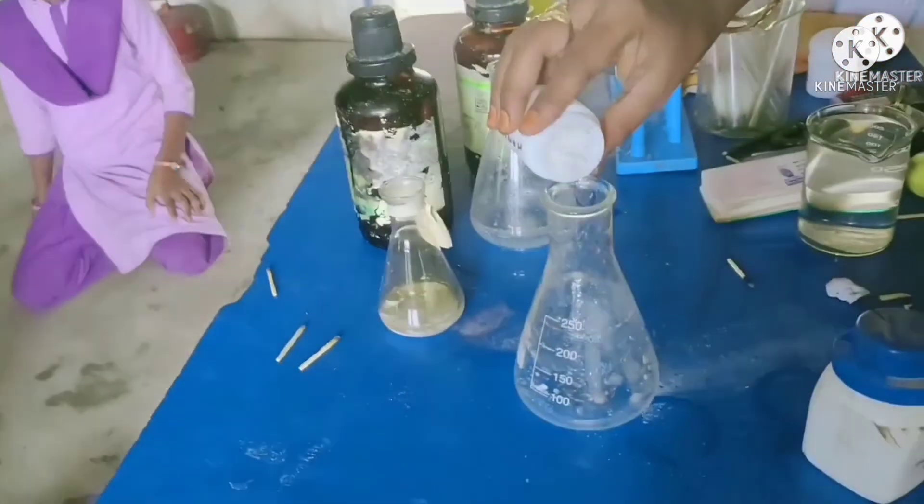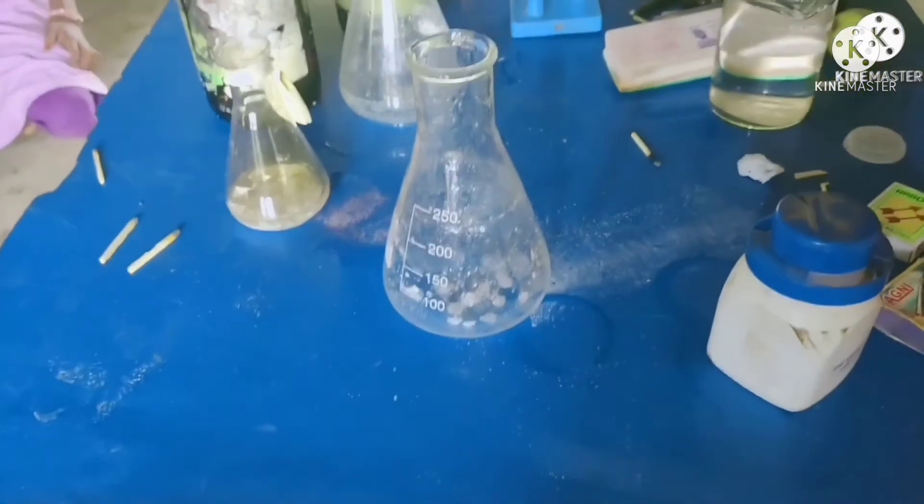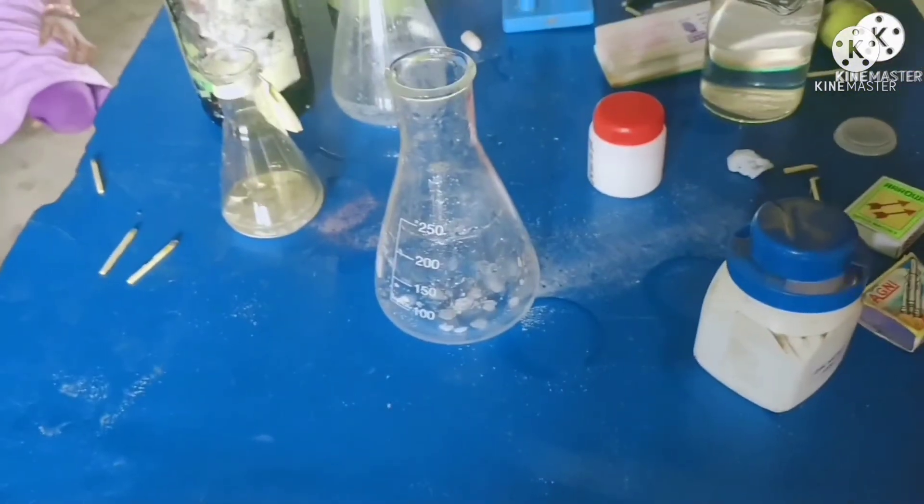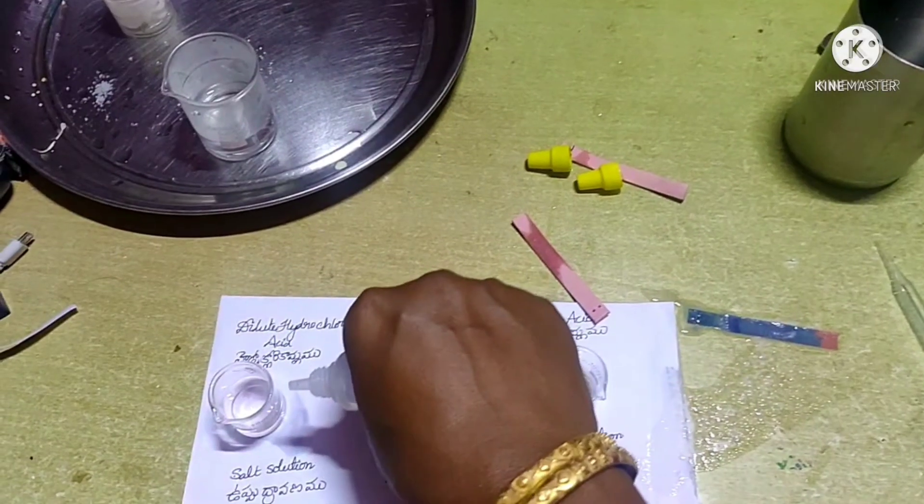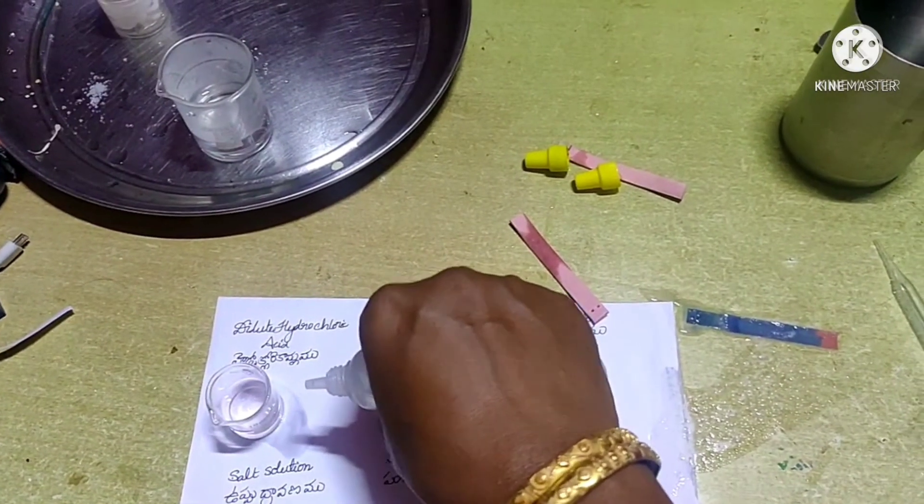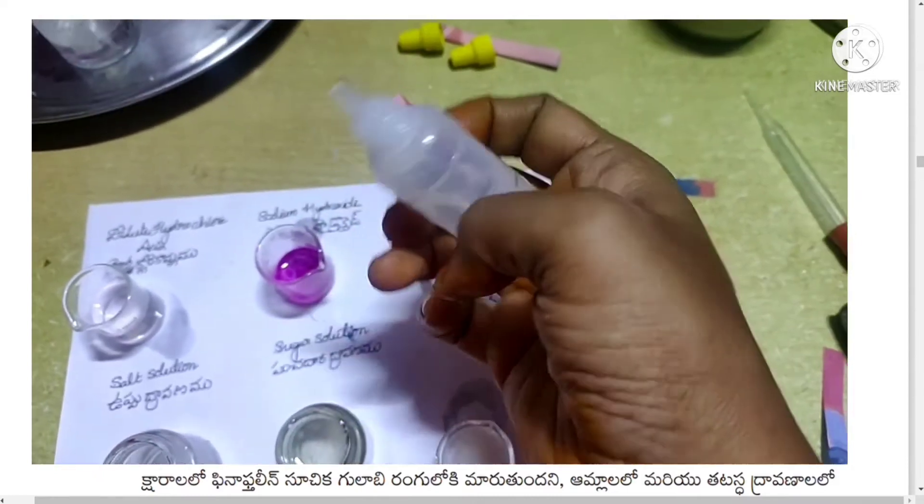See Activity 7: Take sodium hydroxide solution in a conical flask and observe its color. Now add two to three drops of phenolphthalein indicator to it. Observe the color - it is pink.